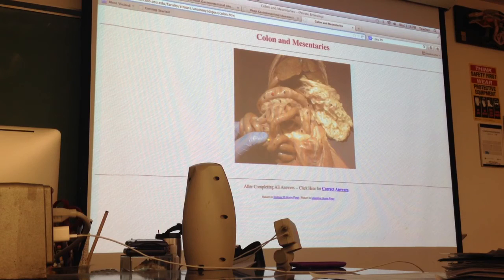And then again, see it dropping down, this would be where it's the descending colon. Now the sigmoid colon is going to be where it brings the colon back to the center. So really if you look right here, kind of the breaking line between the descending colon and the sigmoid colon. You can tell because there's that crease right there, and that crease is where it's going to start bringing it back to the body. They've kind of pulled this entire intestine a little to the right, so it doesn't exactly seem so clear, but just note that, just like we saw in humans, the sigmoid colon is where it brings the colon back to the center of the body. That's the important thing to remember.